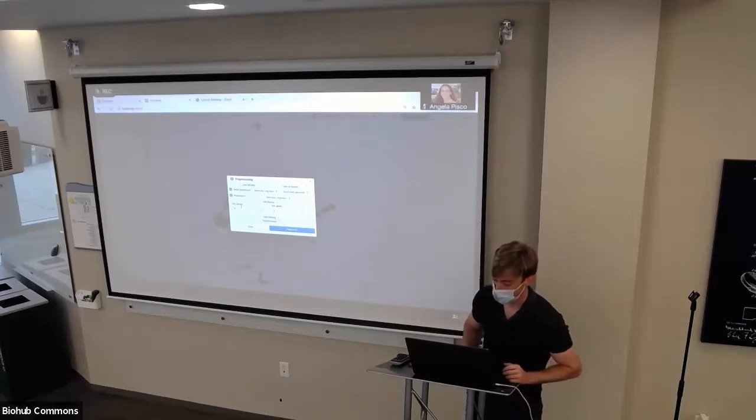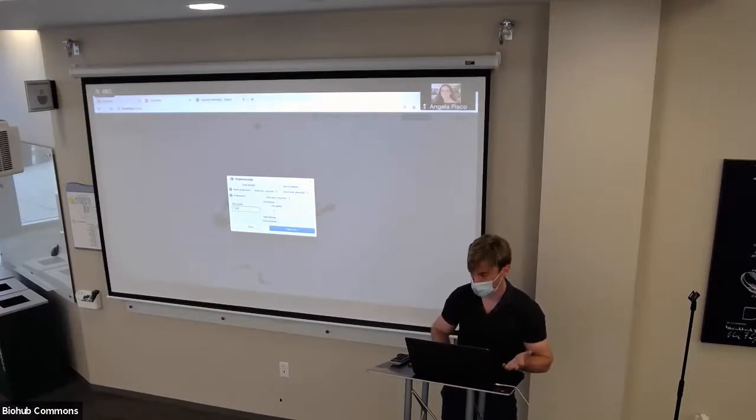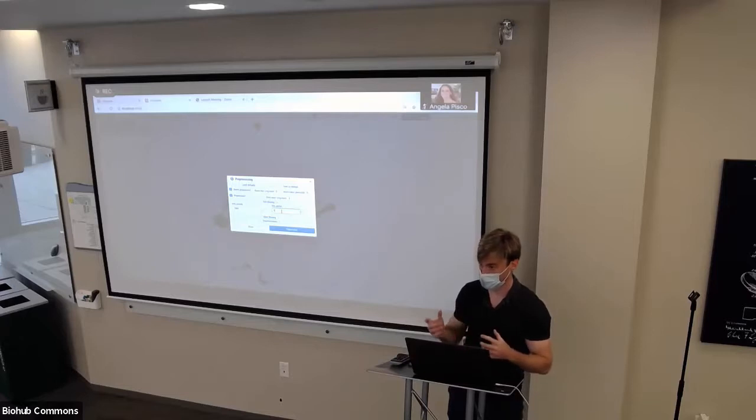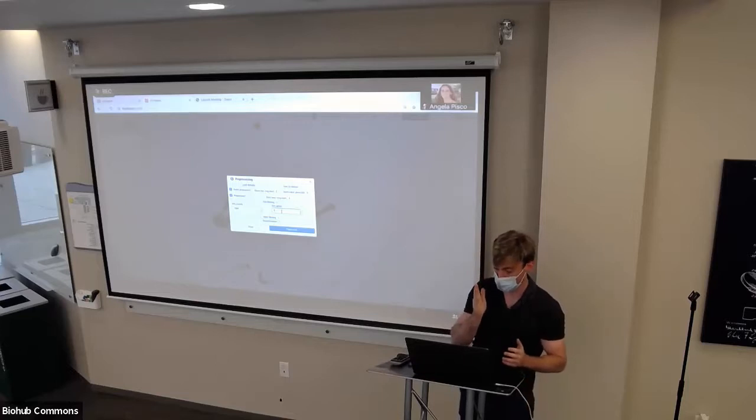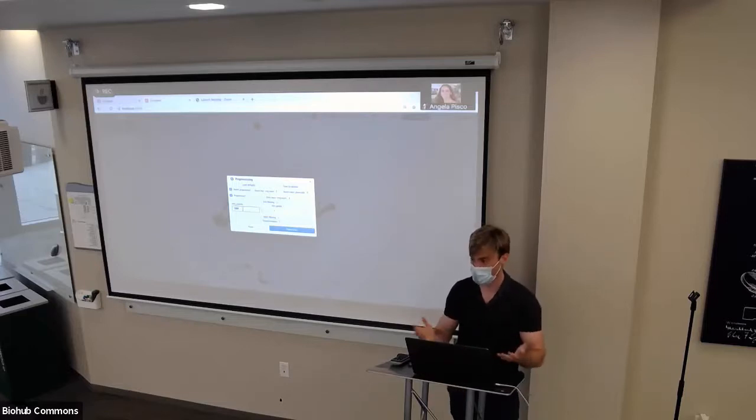Min counts is saying how many minimum UMI counts or read counts does your cell need to have before you filter it out. And here, people typically go with like 1,000 counts or 500 or something. More advanced versions of this could also include, this is something Way actually implemented in SE Friendly, which I got a lot of inspiration from, you can visualize scatter plots or histograms of these sorts of statistics to be able to, in a data-driven manner, choose the right cutoff. But for now, we're working blindly. So we'll just say 1,000 min counts, which is pretty decent.